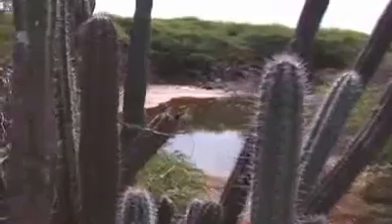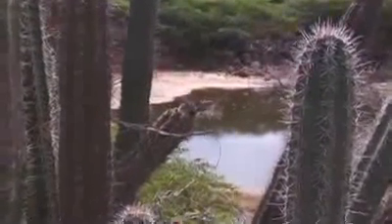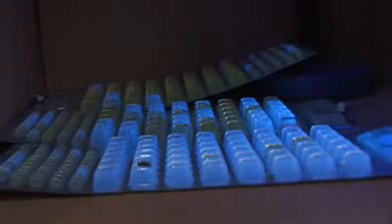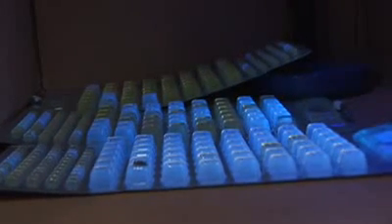The second tray that you see there came from the ravine, from the dip there that we filmed, where we took the second samples from. And you see it's slightly less, but still definitely dominant in the coloration. And when we come to the well water, we should be seeing nothing. We should be seeing clear water. This is water that's used municipally for animals, for groundwater irrigation, and in some cases people still do drink it.